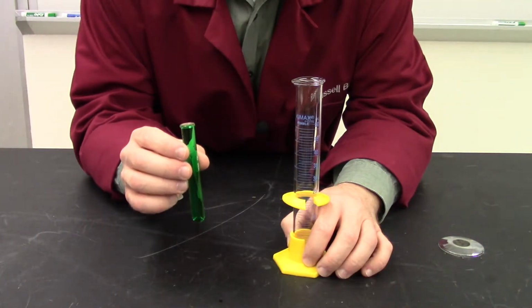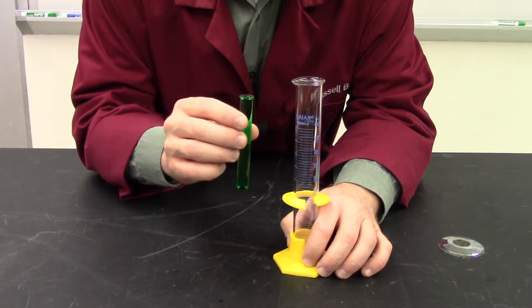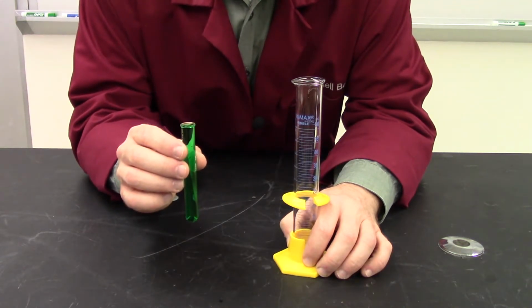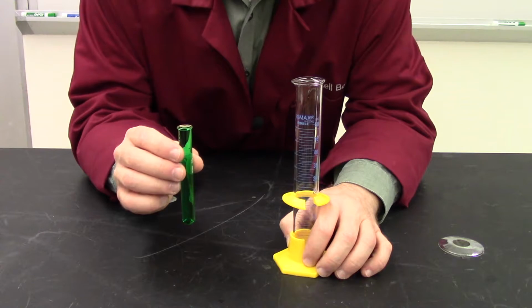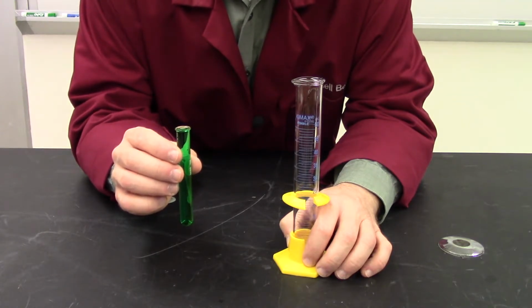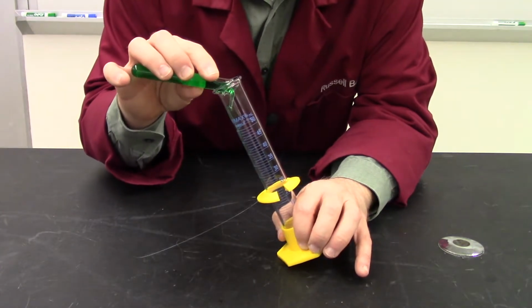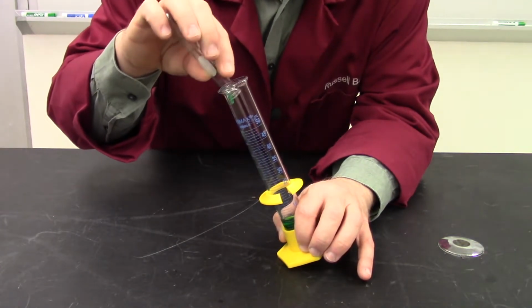All right, class, now I'm going to pour the entire contents of this test tube into this graduated cylinder. This is a 50 mil graduated cylinder. I know that your book says to use a 25. That's okay. I don't happen to have a 25 milliliter graduated on me at the moment, but I promise you the 50 milliliter graduated will measure exactly the same way. So let's pour the contents into the grad cylinder.